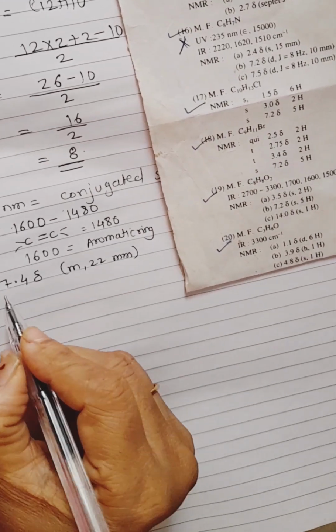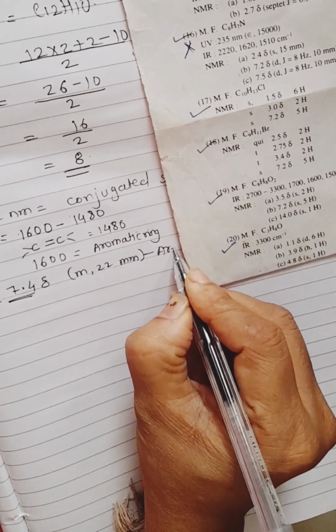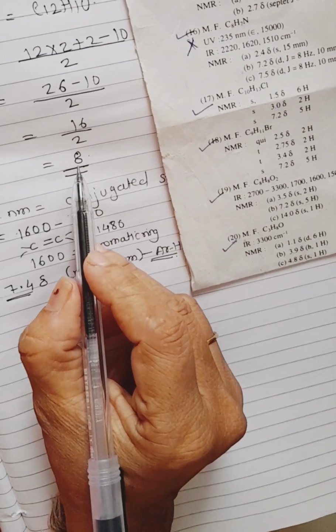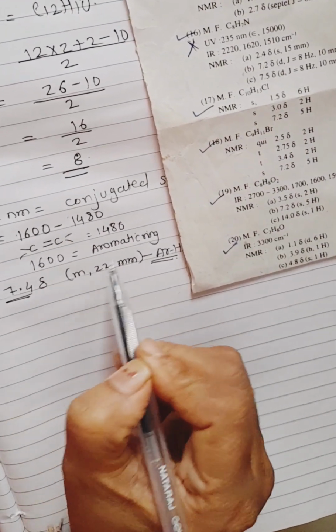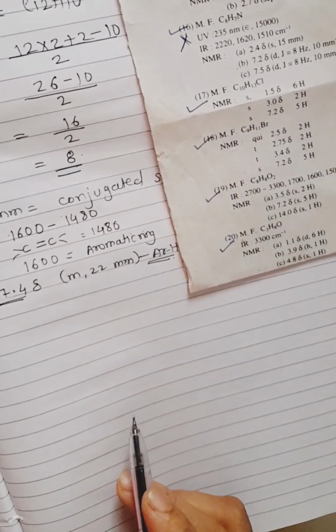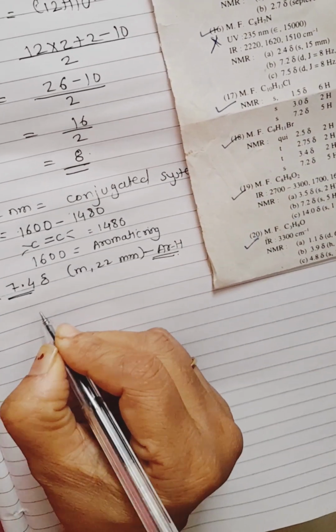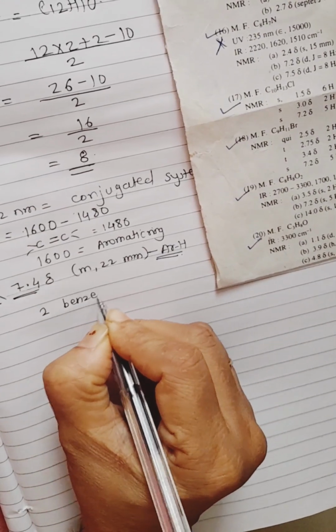Now friends, this 7.4 delta value is nothing but aromatic protons, isn't it? And if aromatic protons, 8 sites of unsaturation, and an aromatic ring is also present, the possibility is only one, that there may be two benzene rings.